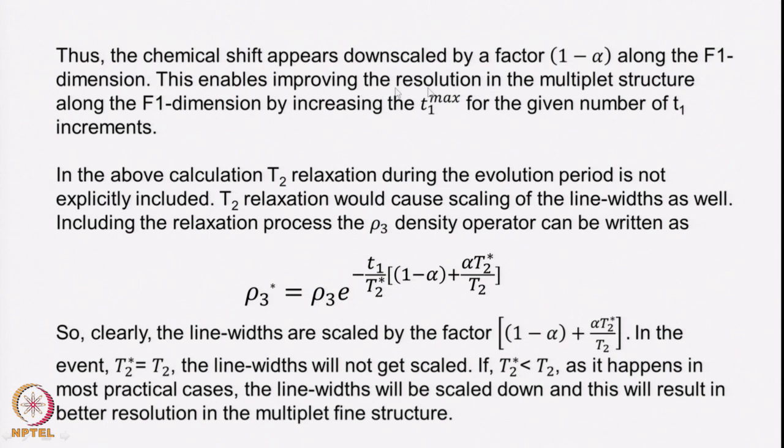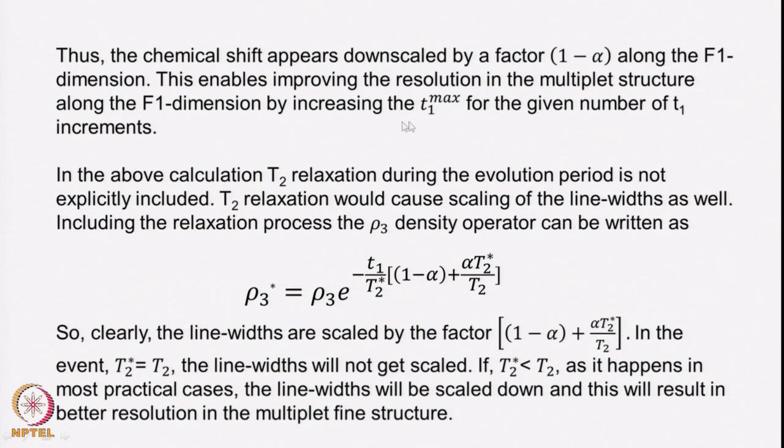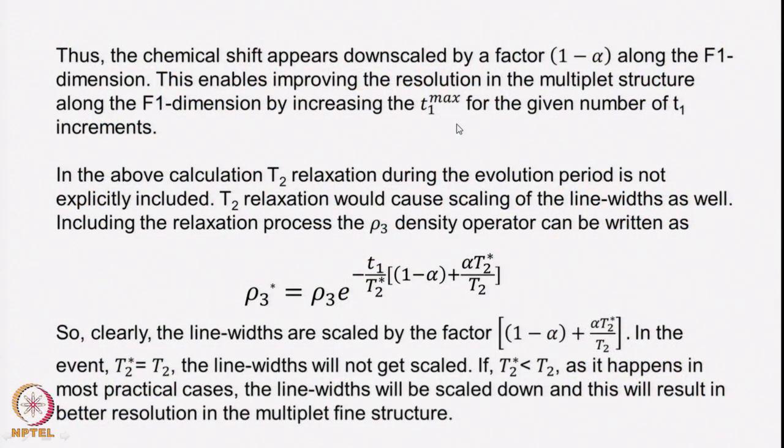So, therefore, again you will get an improvement in the resolution, but however the separation between the peaks overall will get reduced. So long as you can afford that, you can do this, and so long as you can do it in such a way that the peaks do not overlap on each other, you can achieve the enhanced resolution in the fine structure of the cross peaks or the diagonal peaks.